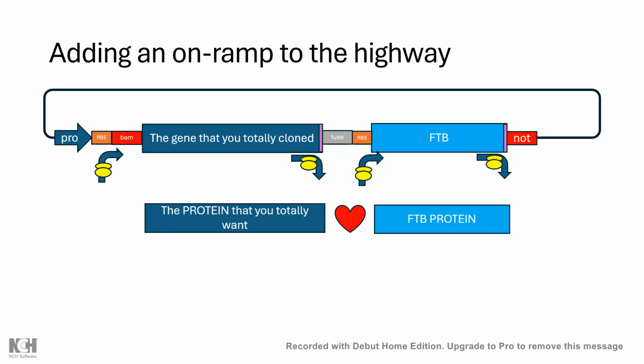That's the distinction. So that's the point I'm trying to get across with, is you can intentionally destroy restriction sites for your long game purpose. Whether it's a vector or a unit, pick. And there you are. I realize I went through it a mile a minute.